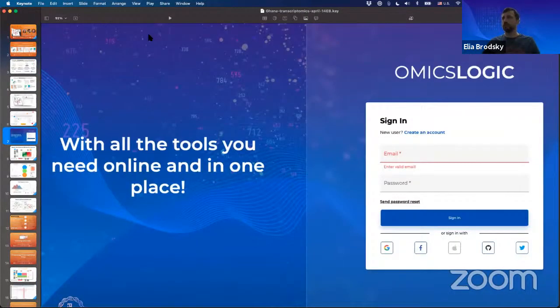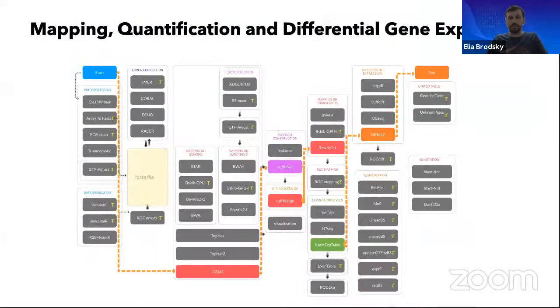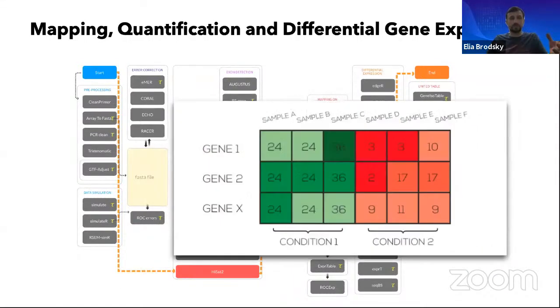Okay, so as I mentioned, one of the challenges is big data. In this program, you will get access to these big data tools that will allow you to analyze RNA-seq data. First of all, we will prepare the processing pipelines to get the simple gene expression table or to perform differential gene expression, which are some standard analytical techniques typically used in the context of RNA-seq experiments.